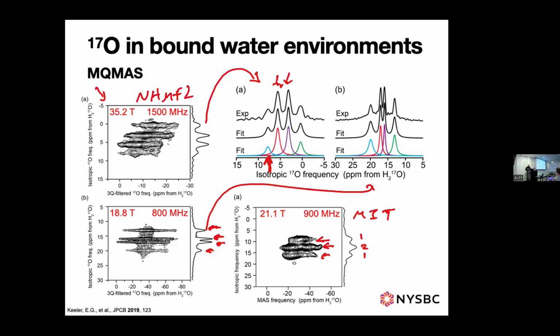No, so the reason why I'm interpreting the intensities, and this is a good question to ask, is because the quadrupolar couplings of these are all almost the same. So we expect the triple quantum excitation and conversion of them. They have very similar chemical shifts, so we're not expecting effects of being off resonance. But no, in general, multiple quantum MAS experiments are not quantitative, they're qualitative.